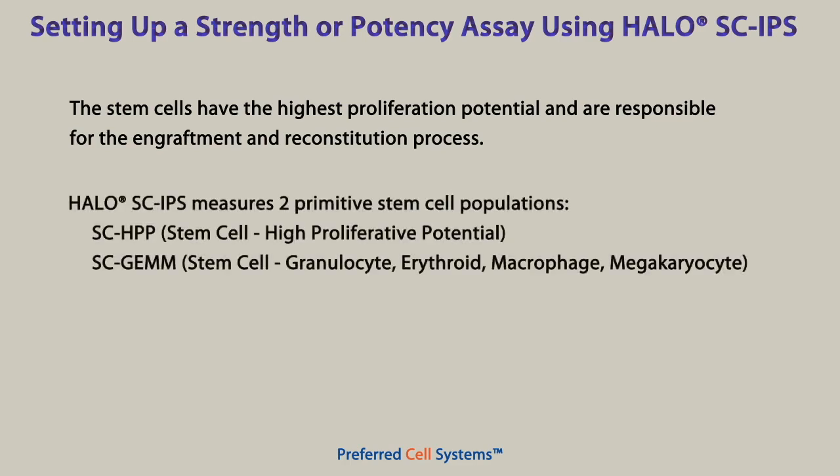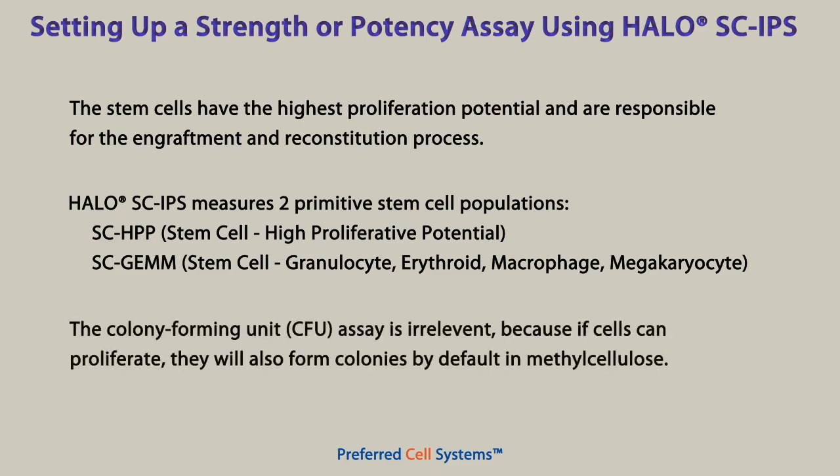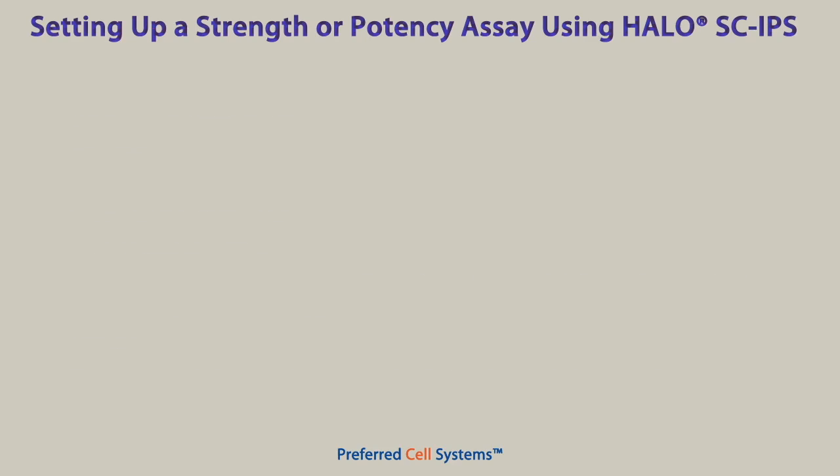However, we are only interested in two primitive stem cell populations. All of the other populations are irrelevant. We are also not interested in whether the cells can form colonies in the CFU assay, because if the cells can proliferate, they will differentiate and form colonies by default.